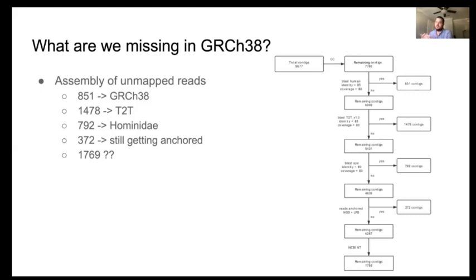We don't really have a good sense what they belong to right now, and it could mean that they are Han-specific novel sequences, larger insertions or larger novel sequences in telomeres or centromeres, but also could be other things. The important thing to show here is that we also screened, of course, for contamination based on the assemblies, based on the sequence preparations or anything. So it's not bacteria, it's not the typical things that you would find as contaminations. This has all been taken care of.